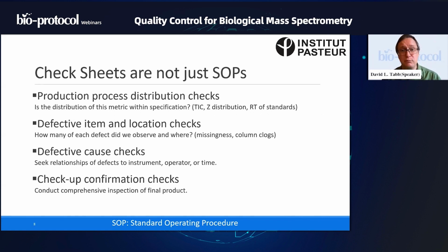And if you had a whole bunch of +1s showing up in your experiment, you might be pretty worried that you had a bunch of ions being collected for tandem mass spec that shouldn't be, that aren't even peptides. So the Z distribution, the charge state distribution of your precursors, is useful to know for that.